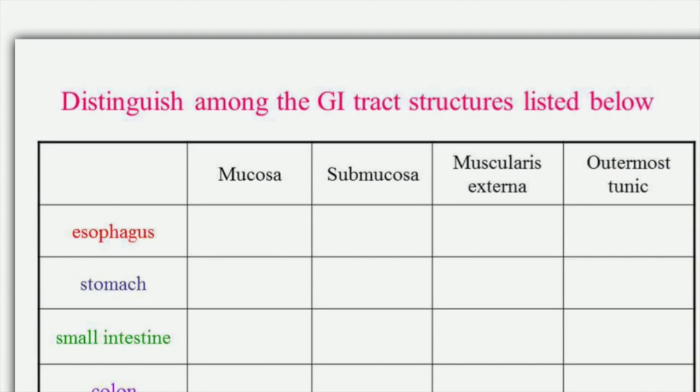The muscularis externa is different in the fundus from the pylorus. In the fundus, it is 3 layers: inner oblique, middle circular, outer longitudinal, but in the pylorus, it is inner circular, very thick to form the pyloric sphincter, and outer longitudinal. It is covered by serosa.